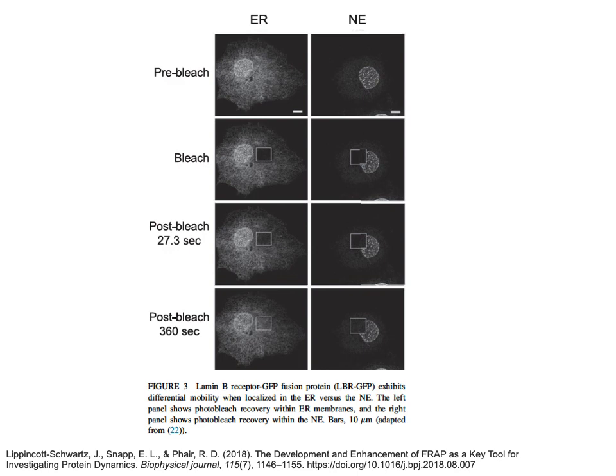It's an exponential factor in the number of dyes that you could use. So with 8 lasers, you could have a system with 8 different proteins you're looking at and how they're interacting, and each one has a different dye tagged to it. So you would be able to see those interactions and how those occur. So again, that's why you can have a price range difference in these scopes.